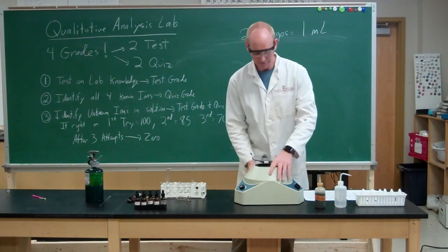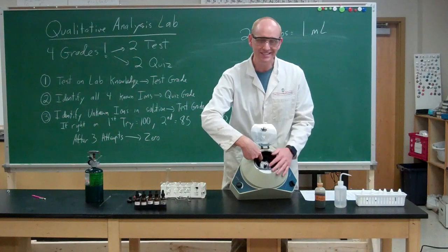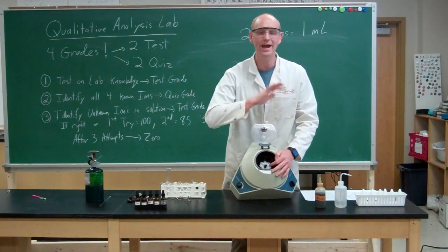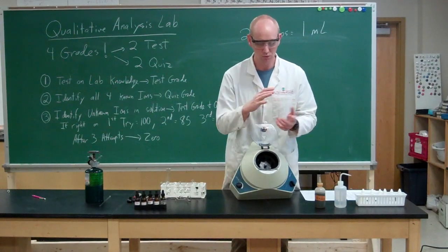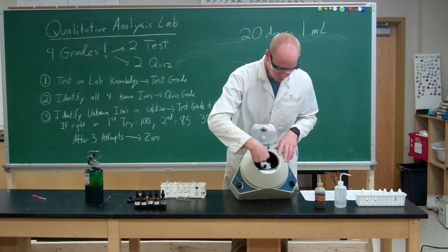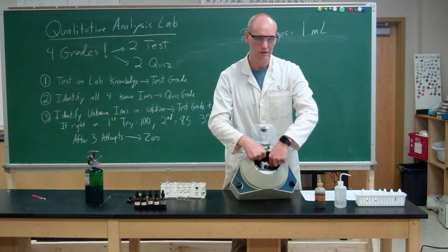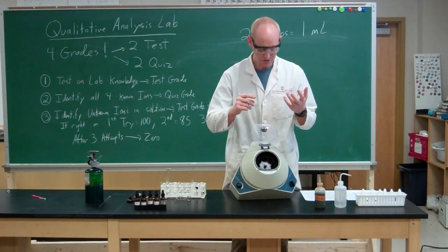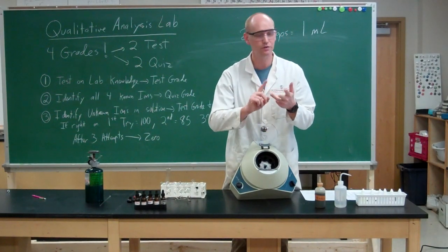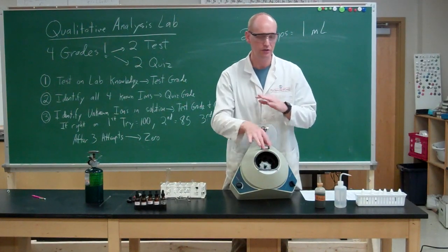So if I have a test tube in slot 1 by itself, that one side is going to be way unbalanced from the other side, and it's going to cause this thing to rock. So if I put something in spot 1, then I want to put something else of equal weight in the spot opposite. You can do 2, 3, 4, or 6 test tubes, based on how many people are using it and how you distribute it.